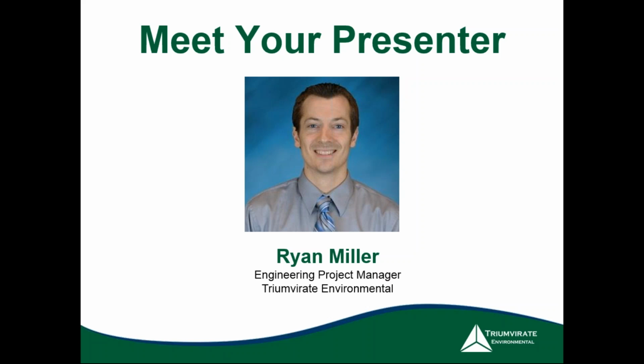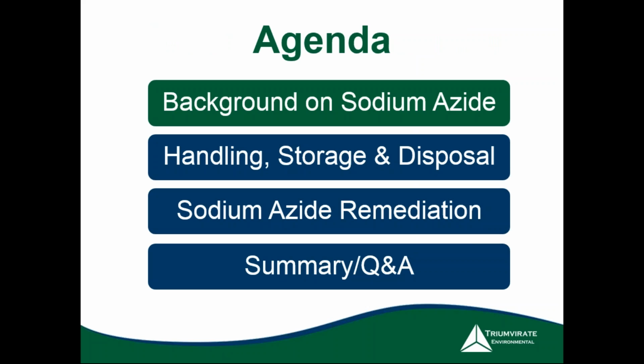And I've also had experience with remediation of sodium azide in laboratory waste piping after, unfortunately, explosions have happened at some of our clients' sites where metal azides have formed, and subsequent work on those pipes resulted in explosions. We've gone in and remediated the rest of the system to prevent that from happening again. And we'll talk about all that today and hopefully get to know sodium azide a little bit better and answer any questions that anybody might have at the end. So the agenda for this webinar: we'll start out with a background, get into handling, storage, and disposal. I'll talk about that sodium azide remediation, and then we'll end with a summary and Q&A.